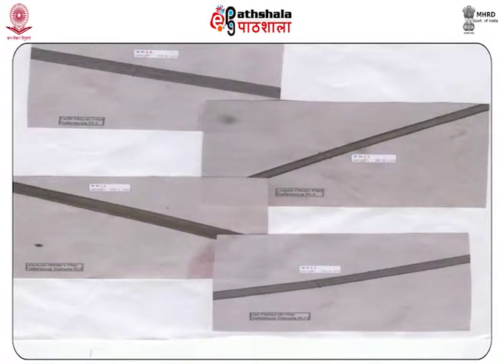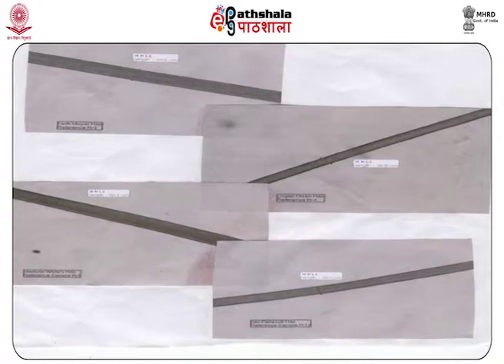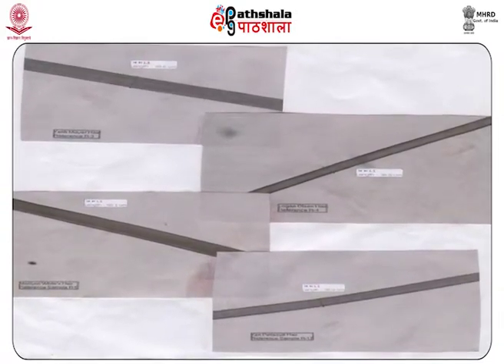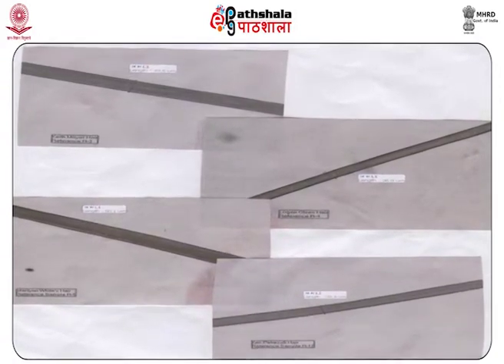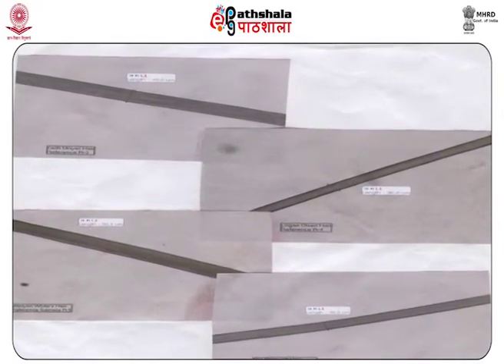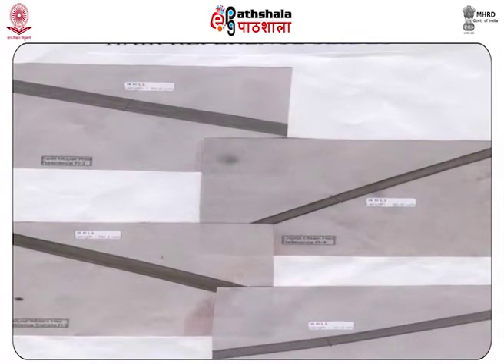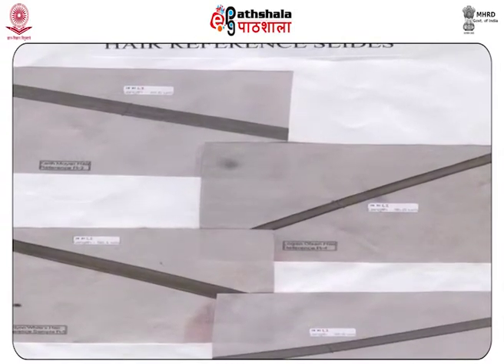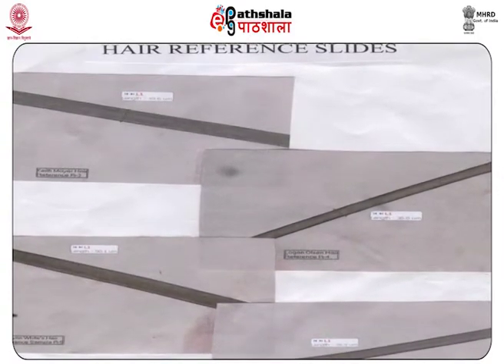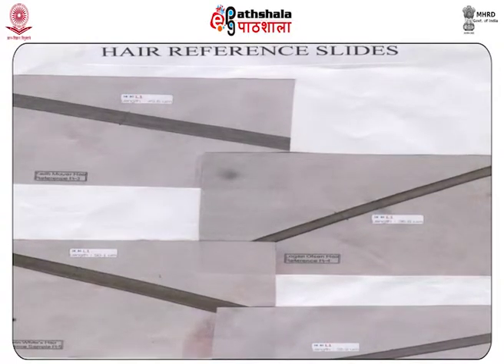Two compound light microscopes are connected by an optical bridge in the comparison microscope, which helps in the simultaneous viewing of the questioned and the known hairs. A glass microscope slide with the known or reference hair sample is placed on the stage of the other microscope. This helps in comparison of the microscopic characteristics of the known and the questioned hair samples. The range of magnification commonly used is approximately 40x to 400x.